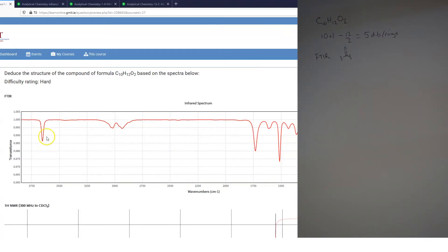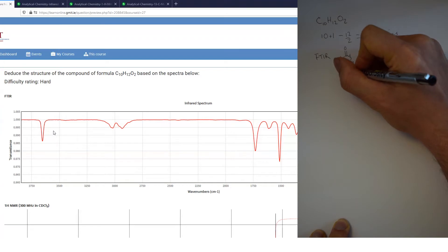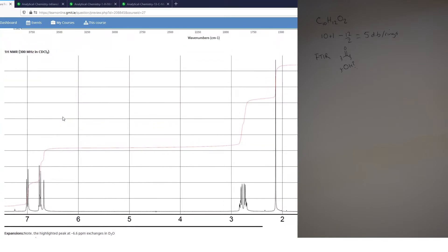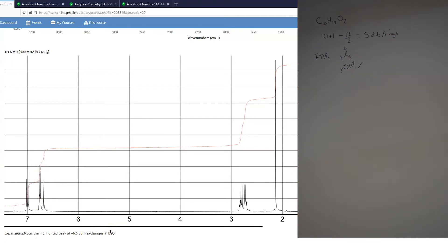We can also see a peak at around 3600, which must be an OH given the molecular formula, but it's not so big and broad that we're assured it's an N-H, so let's put a question mark beside that. Moving on to the NMR: there's a note underneath the peak at 6.6 — it exchanges in D2O. The NMR confirms there's an OH, because it would have to be an OH or NH to exchange, and there are no nitrogens in this molecule. So we have a carbonyl and we have an OH.